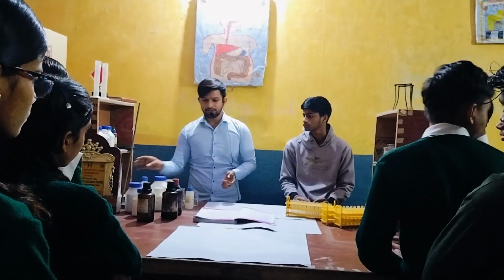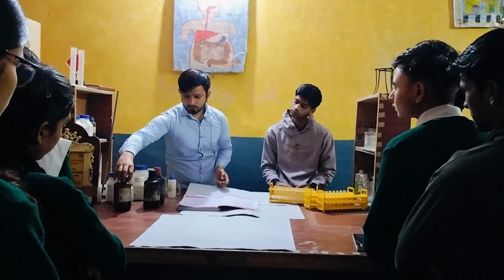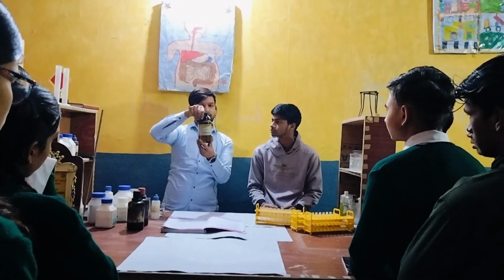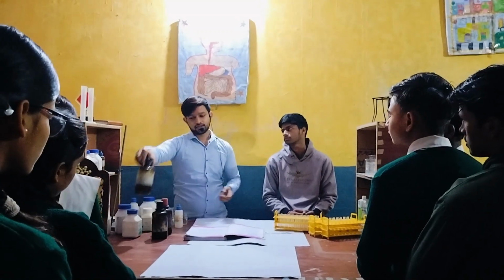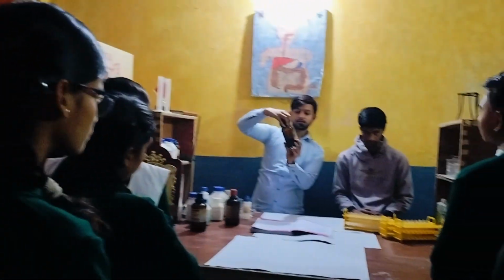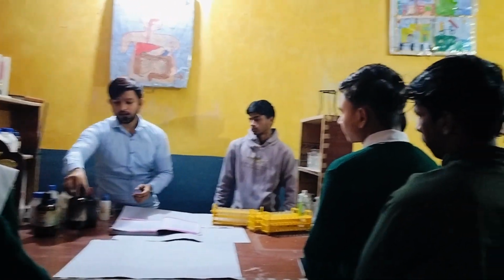We have different types of acid. In this bottle we have nitric acid, HNO3. In this bottle, I think it's sulfuric acid, H2SO4.